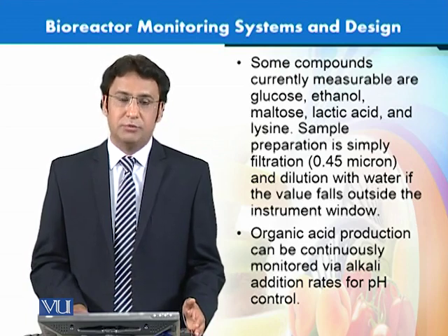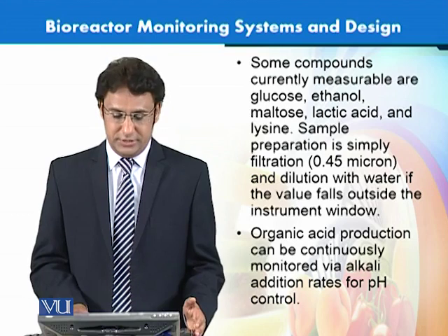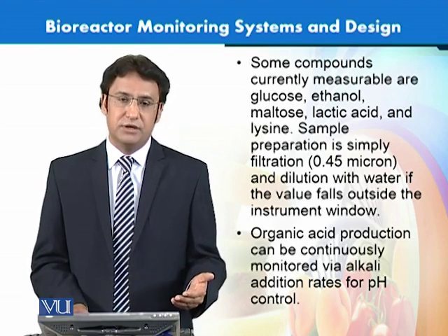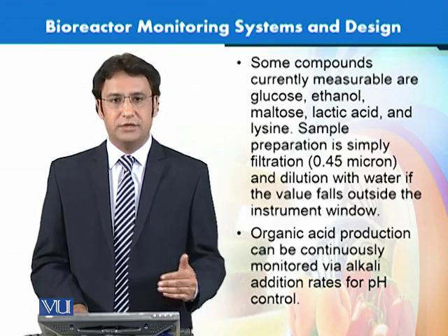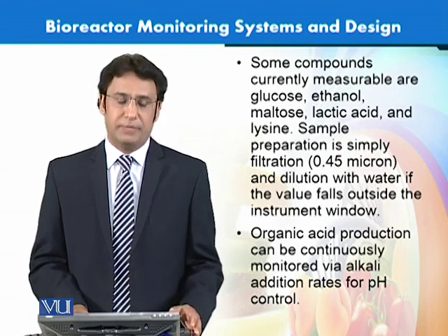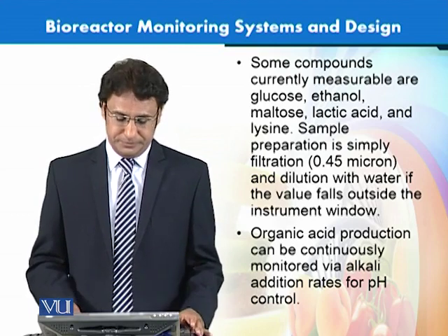And normally sample preparation is simple. We have to use 0.45 micron filtration, dilute it, and look at the absorbance value. If this is above the range, we can further dilute the solution and get the actual value of these compounds within this culture medium.